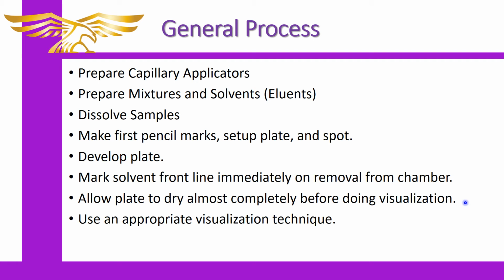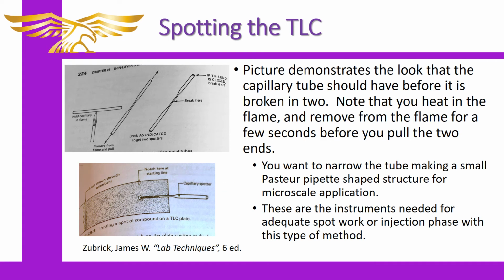It probably takes at most maybe 2 to 5 minutes for most of the solvent to evaporate off of one of these plates. It's because they're pretty volatile solvents, and we usually do this in the hood. So that is important. And then also you need to have an appropriate technique for visualizing. And sometimes we do have to change up our techniques unexpectedly. So we'll talk about spotting.